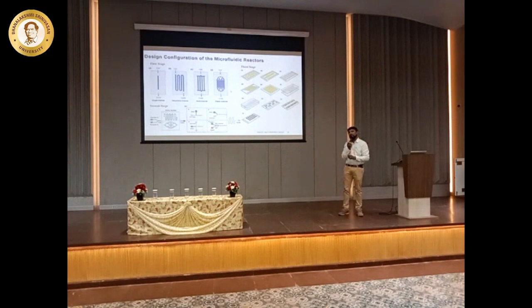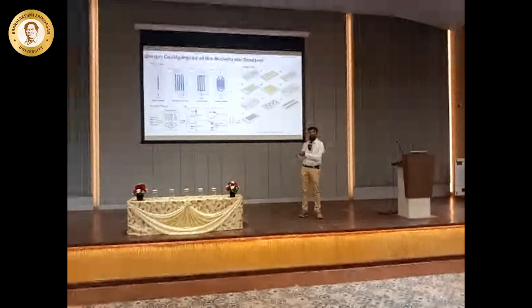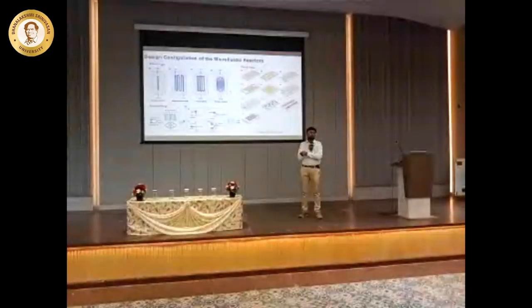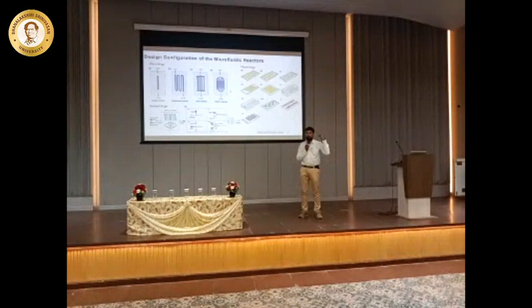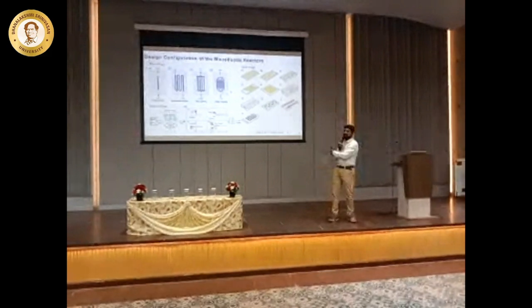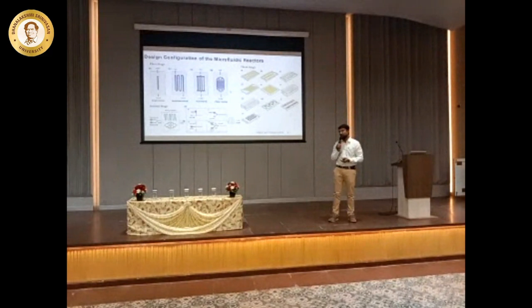This is not only for nanoparticle synthesis, this also helps in blood-based diagnostics. Or you want to interact with blood, or you want to separate the blood plasma, the WBCs, platelets, and all these can be happening. And another important aspect is that the density and the size of the particle also matter a lot when it passes through this channel. Because you put the blood in, Ashish sir was talking about the blood plasma separation. The RBCs go one side and plasma goes the other side. It's just because of the density of the RBC when compared to WBCs. Right? That is what makes it separable when we use it in a channel.